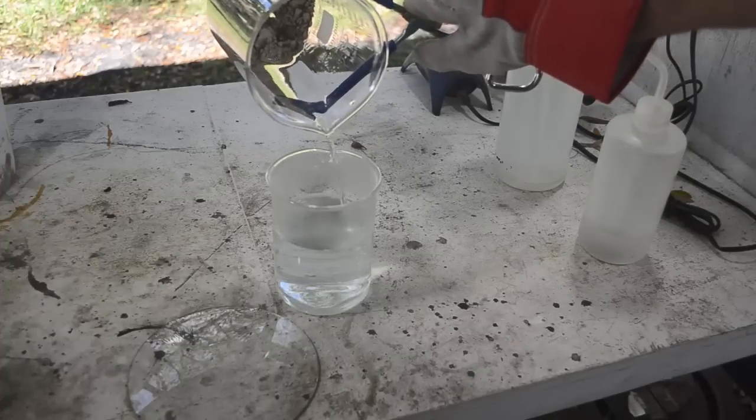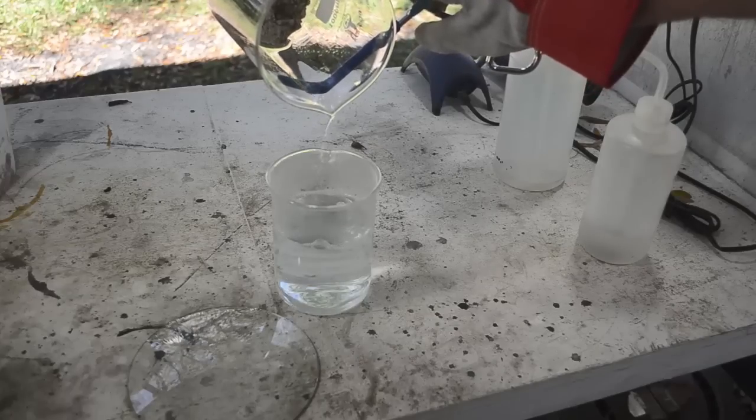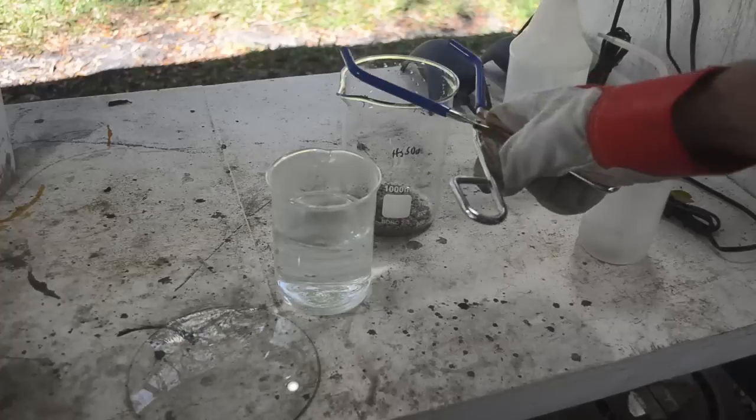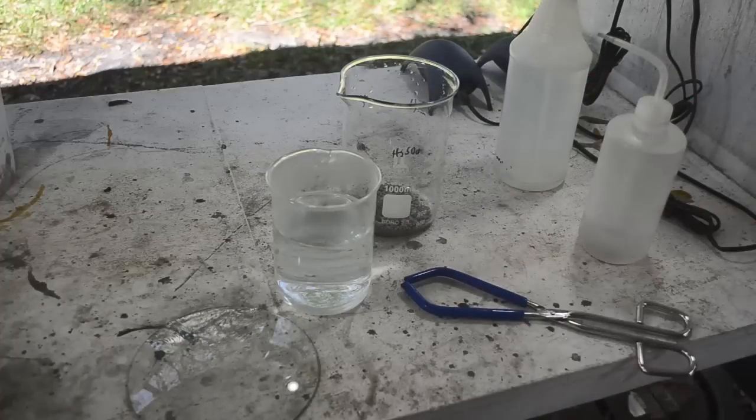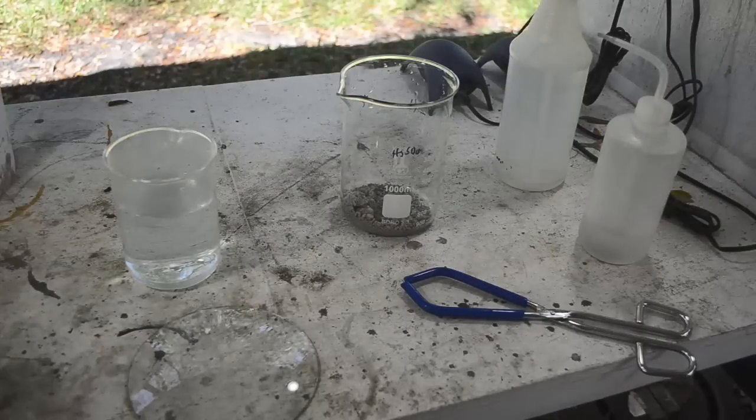And I will rinse both of these much better later. But I just wanted to get this liquid off of the silver quickly so it doesn't have a chance to dissolve more silver than it may have already dissolved. Not worried about the hydrochloric acid dissolving any silver. That's not going to happen. Okay. So I'll set that liquid aside.